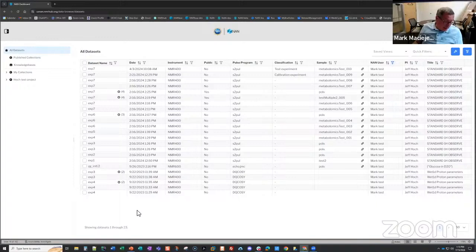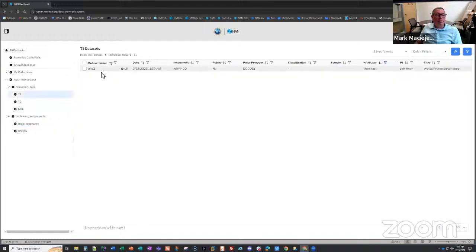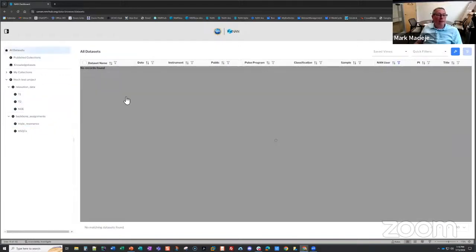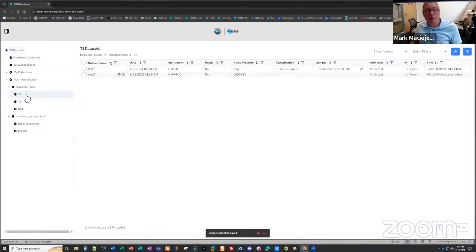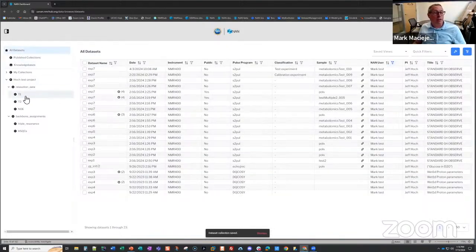So now I think we'll move on to, I can show the project studies and collections. So over on the left, you can click all data sets. You have a test project. You can break down into studies. In this case, these were just test ones, but you do relaxation data sets, and then you can have collections underneath there, and you can click on any of these things, and you can see data sets that are inside any of these. And if you want a data set in any of these, you just literally drag it and drop it, and then it's part of that collection. So it's still always in all data sets, but it's now also associated with one of those collections. So project studies and collections are just a really nice way to be able to organize your data.